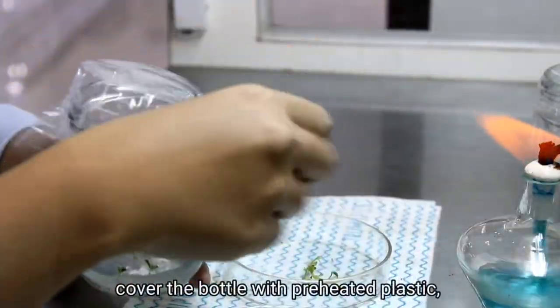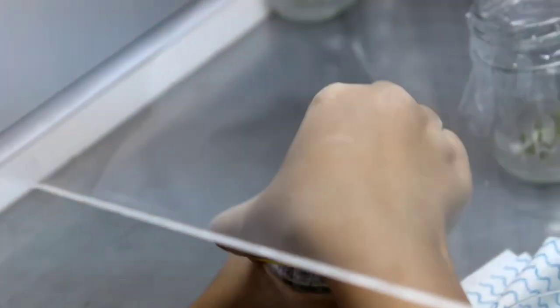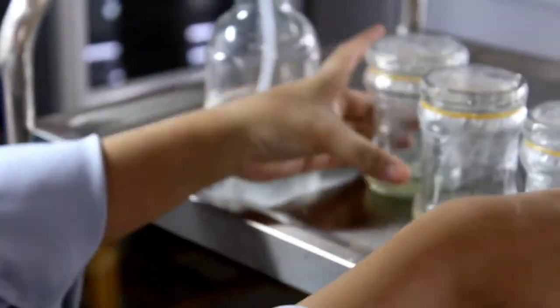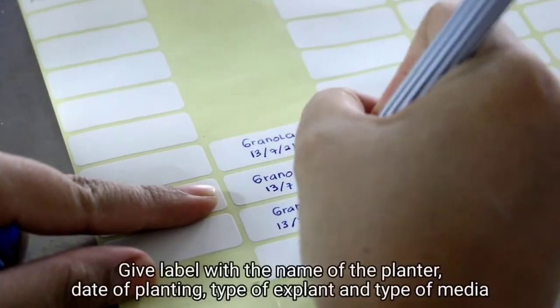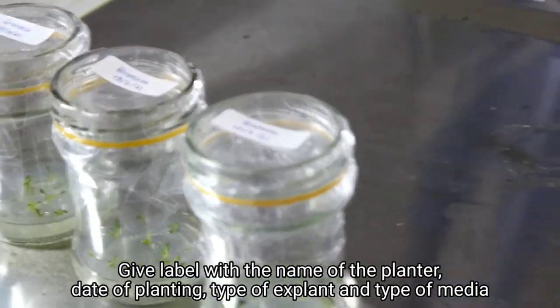Cover the bottle with preheated plastic and tie back with rubber band. Give a label with the name of the planter, date of planting, type of explant, and type of media.